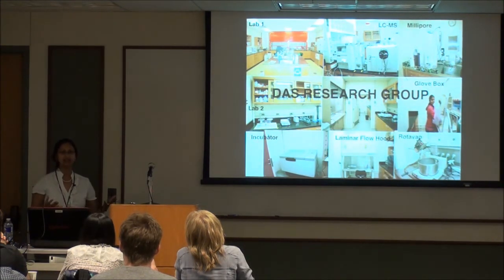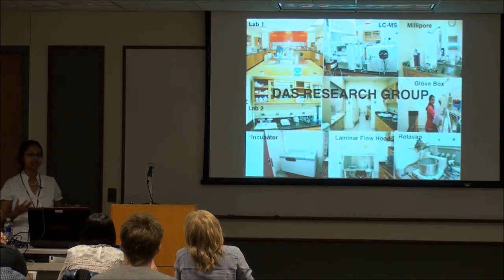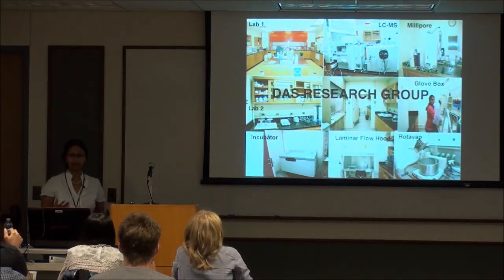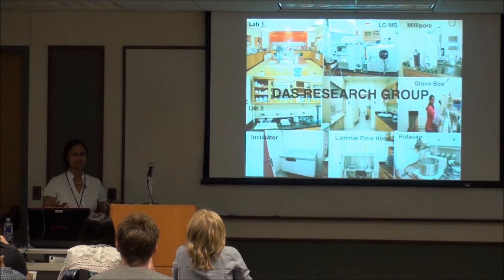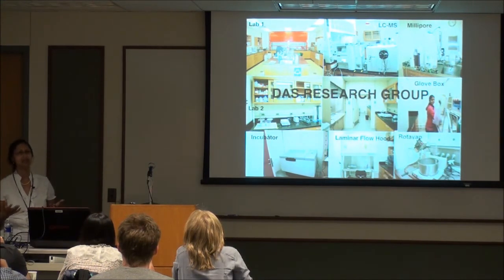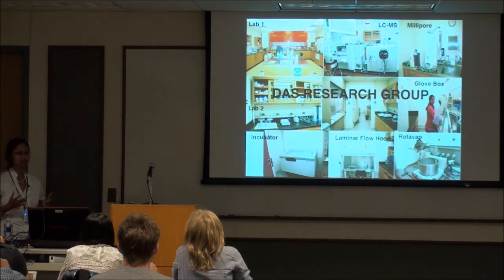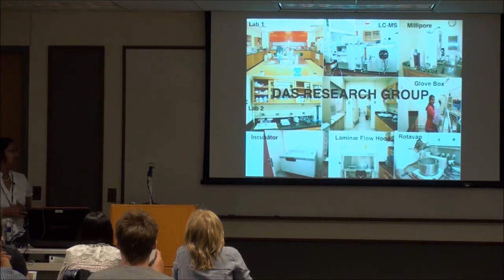And the other thing my lab is interested in is combining ultra-sensitive nanodetection tools for looking at drug binding to the membrane proteins. And I will explain why we do that and why we are interested. There is a huge need of more ultra-sensitive devices to be coupled with drug binding to membrane proteins, because that's sort of a need right now, both from the biochemist's point of view, from a doctor's point of view, and overall.